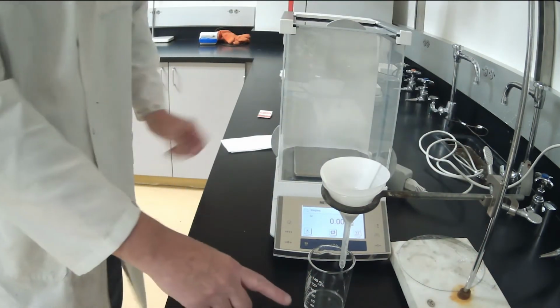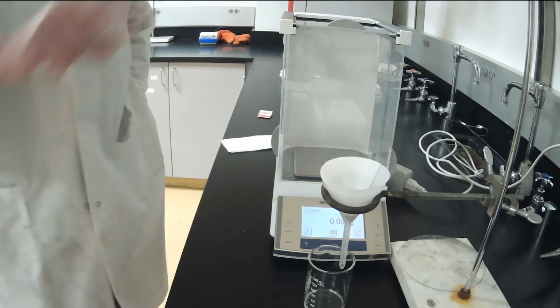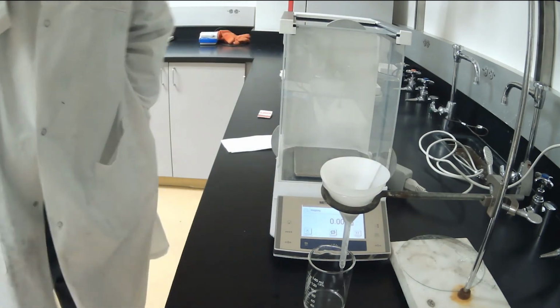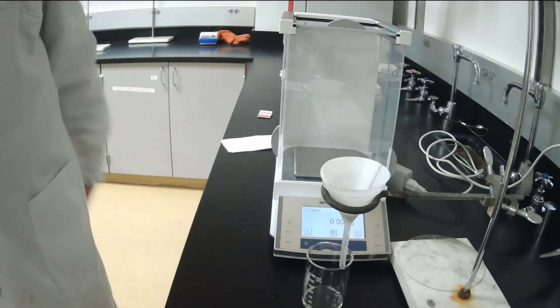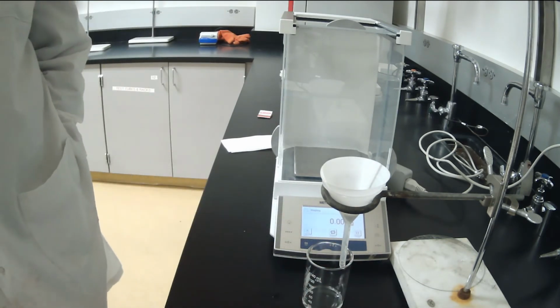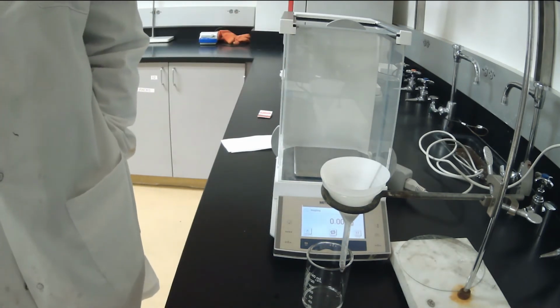Alright, you see the liquid is collecting down at the bottom. That's where our water is dripping. There's water in the top, and here is one of the questions that's always in the homework. Where does the sodium chloride go? Well, you'll say it goes into the water. Where does the water go?